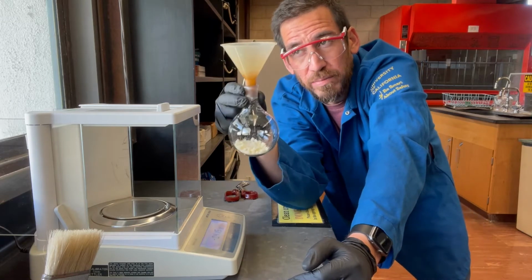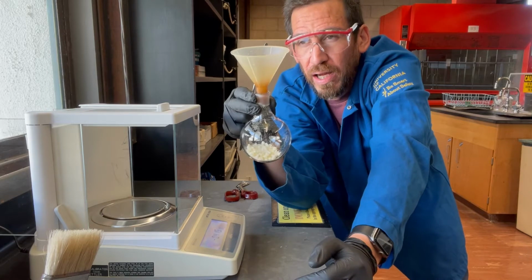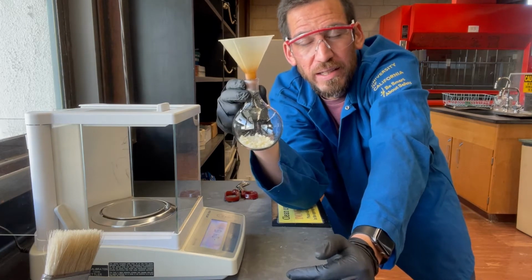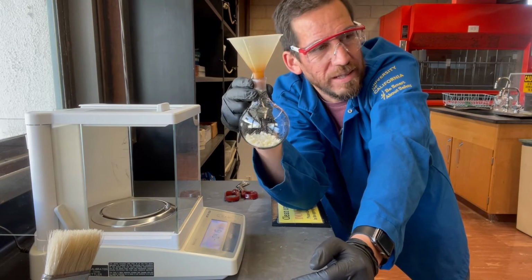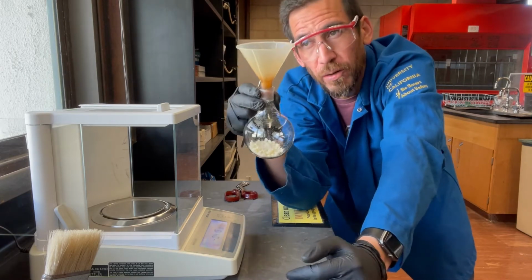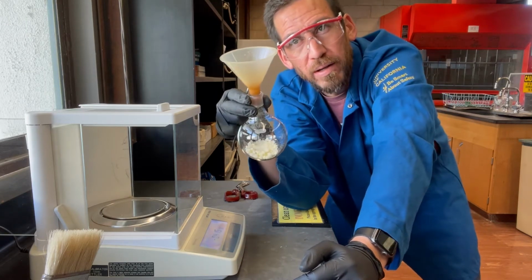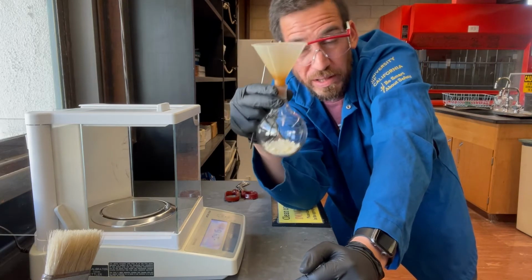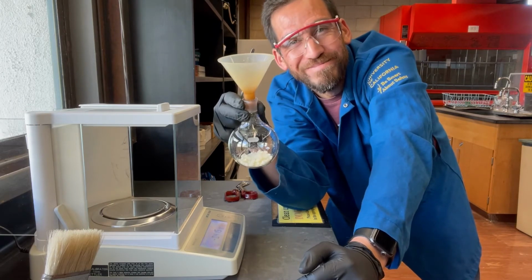I like 5 grams instead of more than that. I don't want to put all of that in there, because for me personally, we're using nitric acid. Nitric acid's kind of gnarly. We're releasing a bunch of gas and it's nasty, and so I want to minimize the amount of nitric acid that I have to use, and so I don't want to make too much LA smog in the lab, and I think that 5 grams will be converted to enough product to go to the next step. We'll see though.